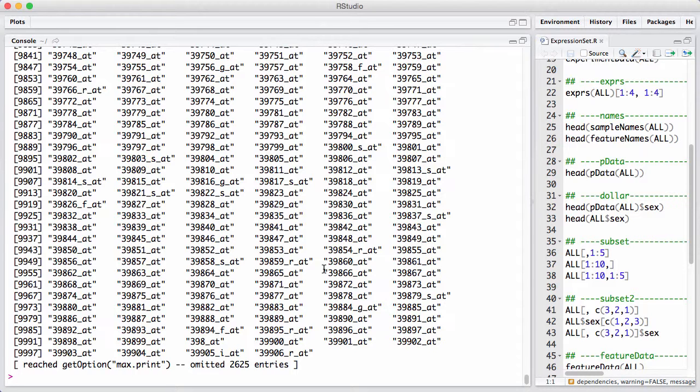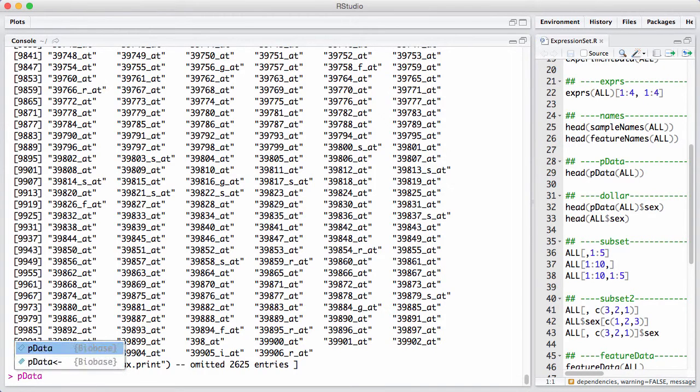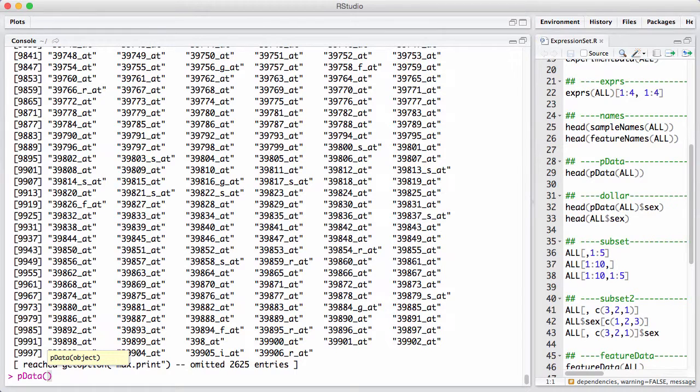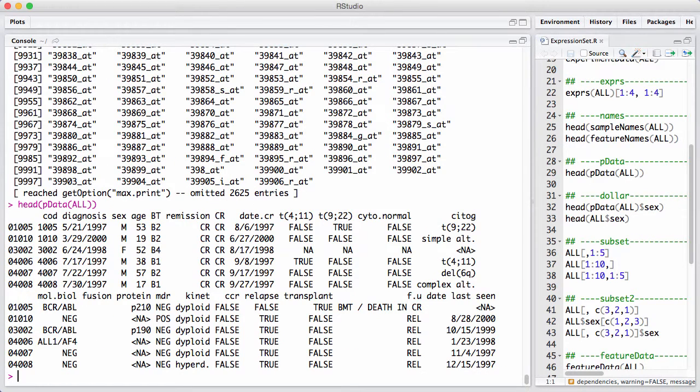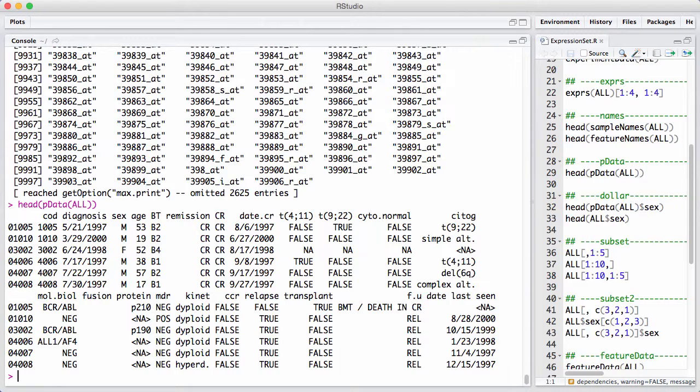We're also very interested in the phenotype data. The phenotype data is covariates or information about the samples that was being run. We get that by using the accessor function called pData, p for pheno. And this is a big data frame. It has 128 rows now. So we are just going to print the top of them. We can see there's information about the samples such as the sex, the diagnosis, the age, and various other types of information that are important in order to interpret the data.